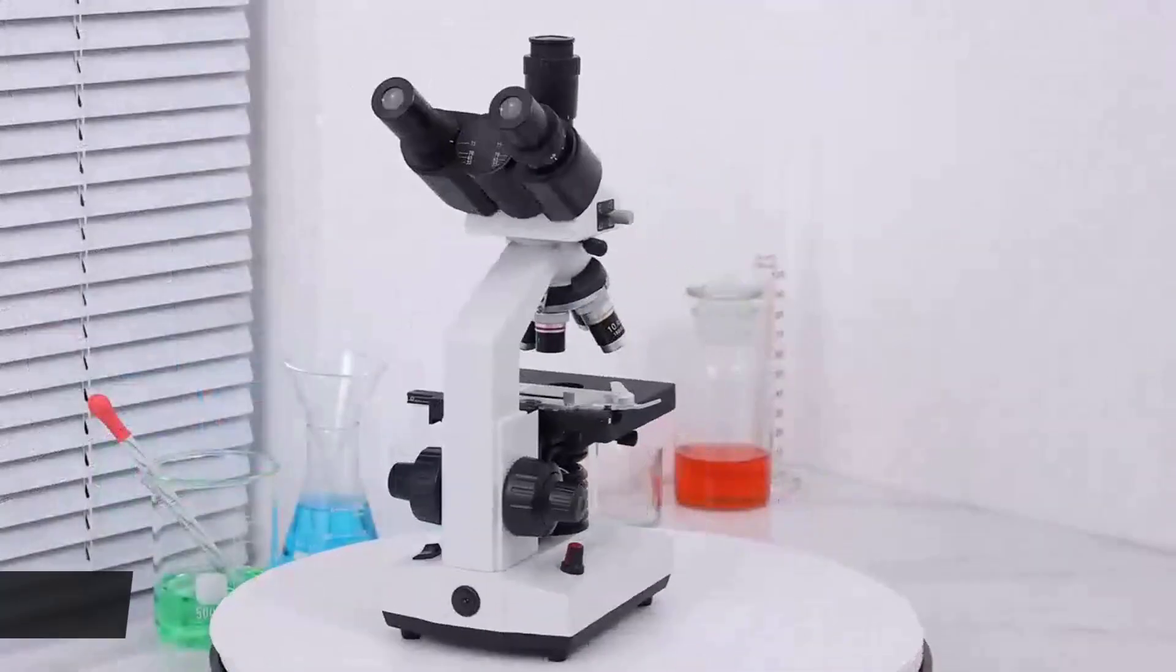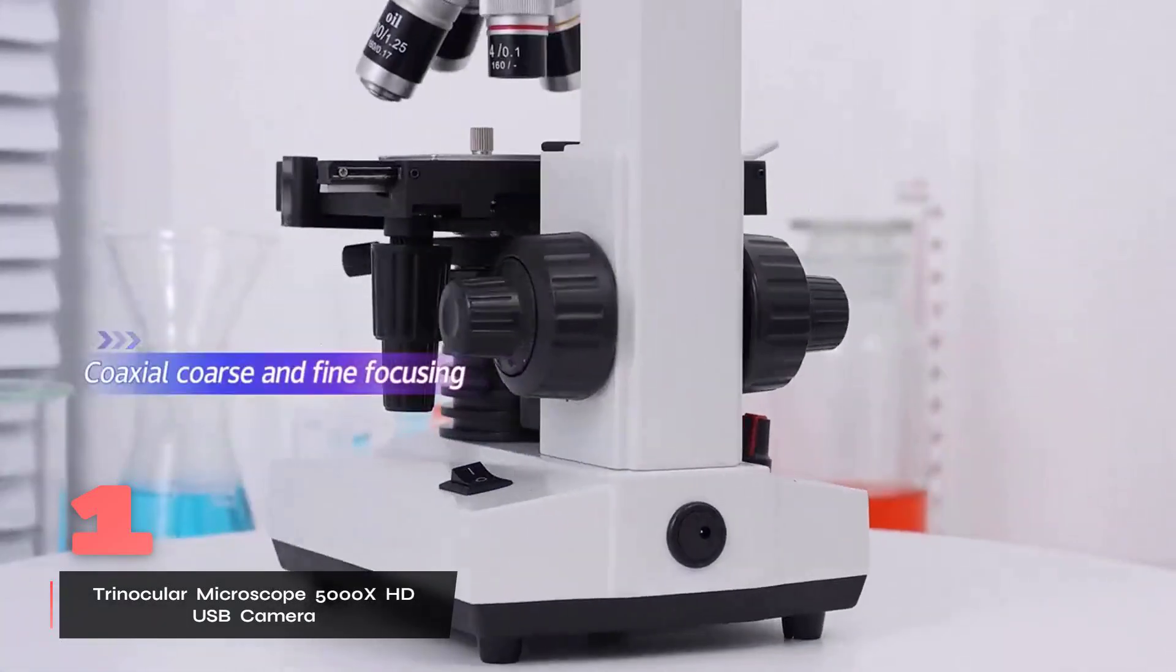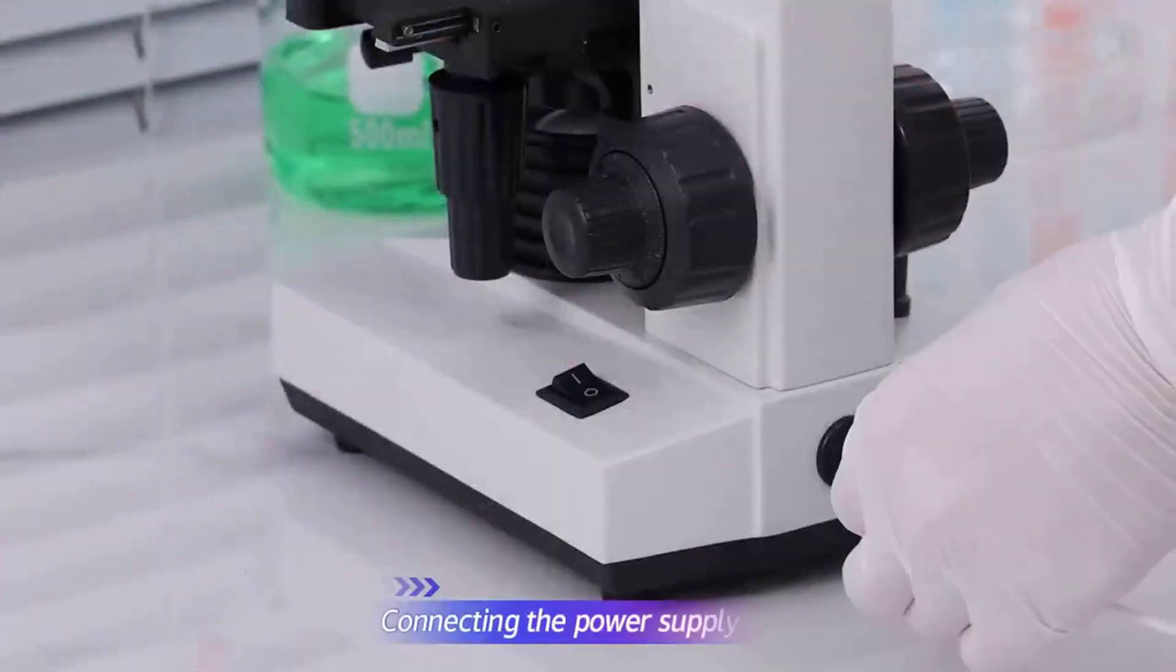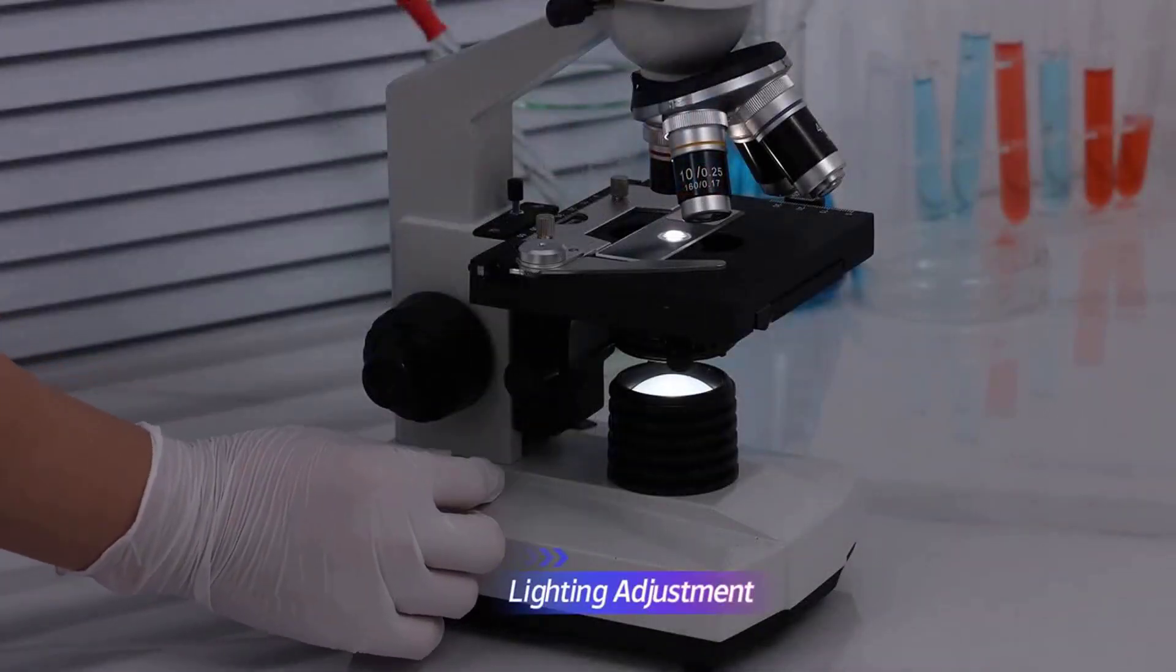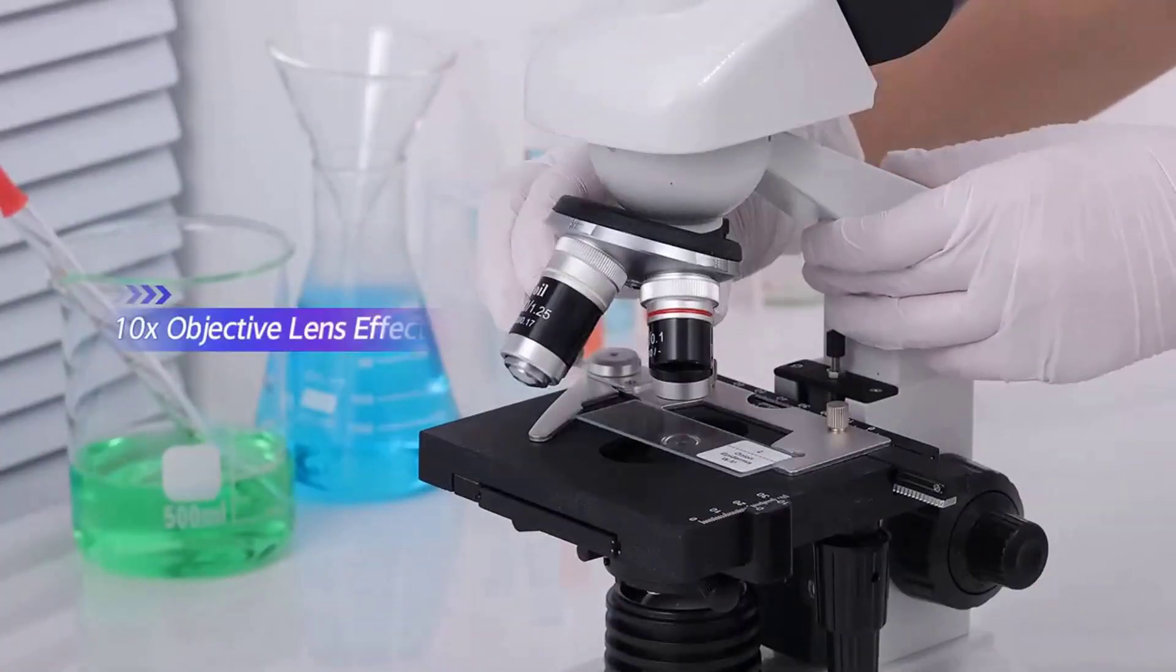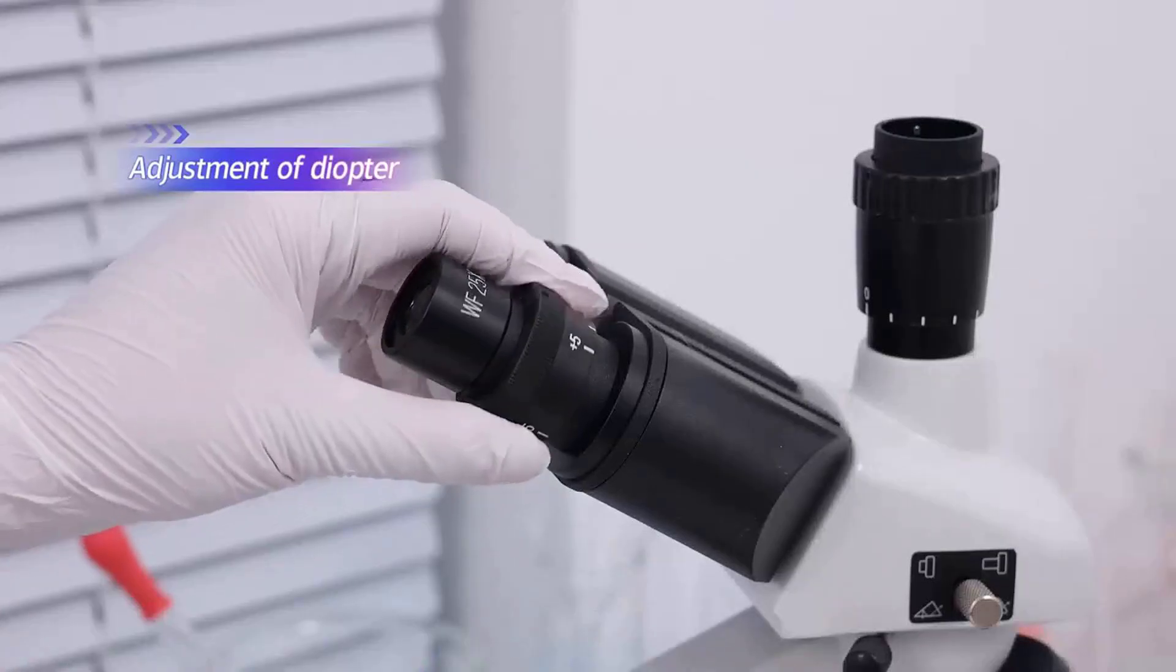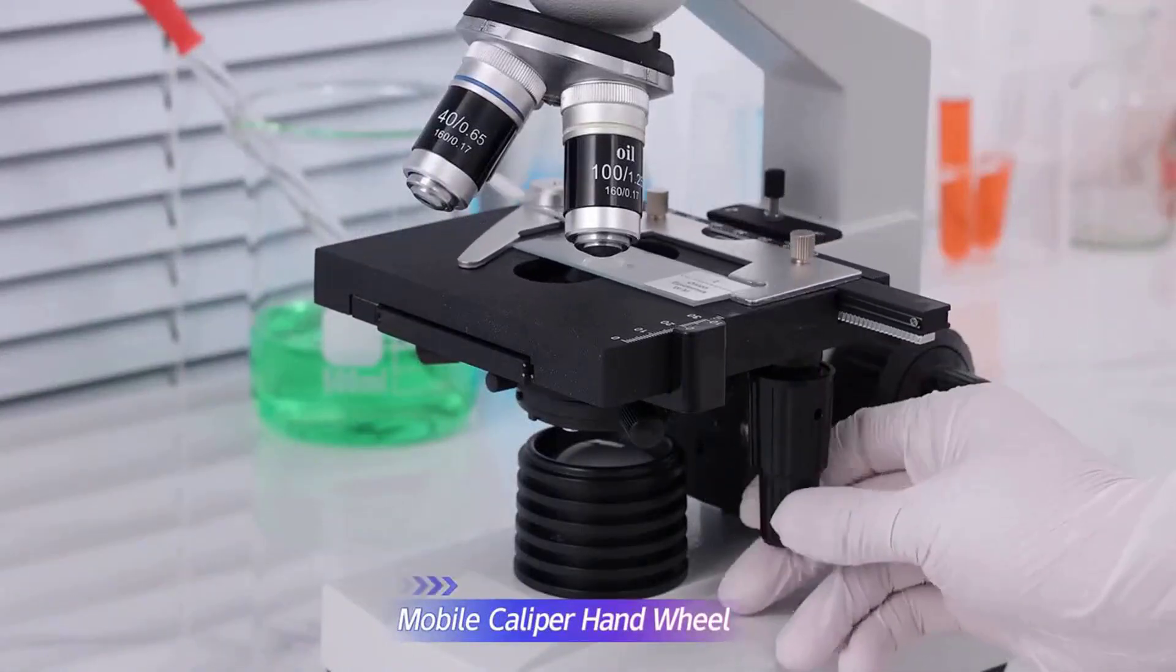Number 1, the Wohirsch Trenocular Microscope 5000x HD stands out as a remarkable instrument. For researchers frustrated by fuzzy visuals or insufficient magnification power, this model offers an impressive solution. With magnification capabilities spanning from 40x to an exceptional 5000x, it significantly outperforms comparable options. The Premium 195 Achromatic Objective Lens ensures exceptional clarity, delivering vivid colors and crisp details.